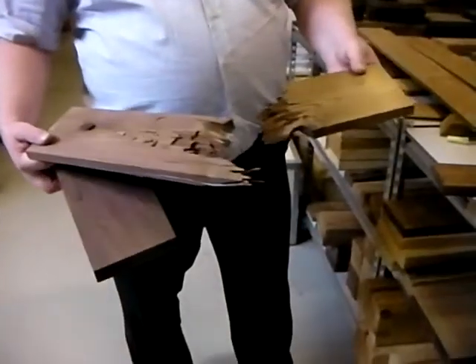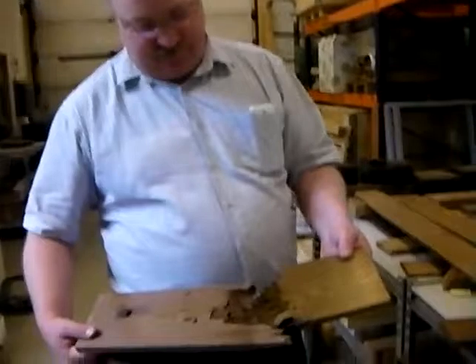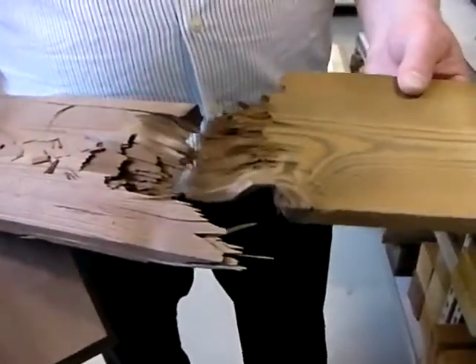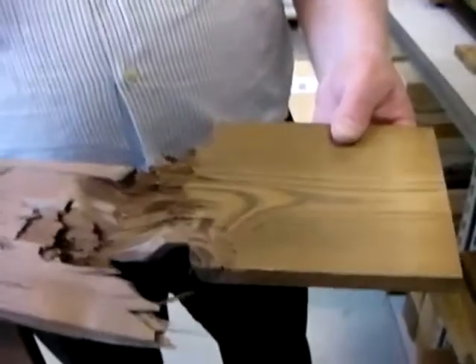This is the D1++ treatment level. After strength testing you can see that all the fibers are still long, which makes it very strong. The bending stress applies weight here and it finally breaks.